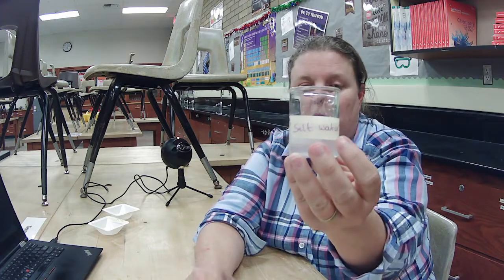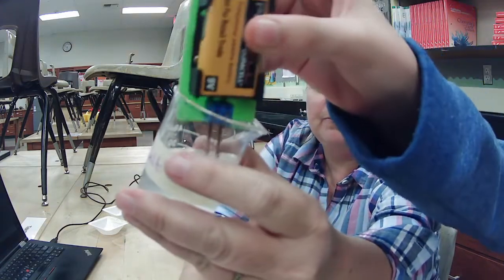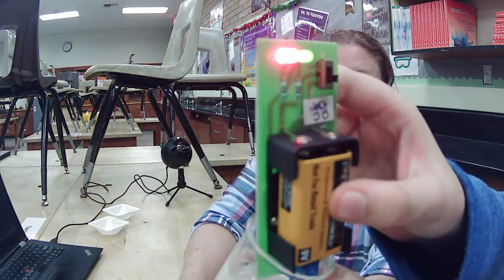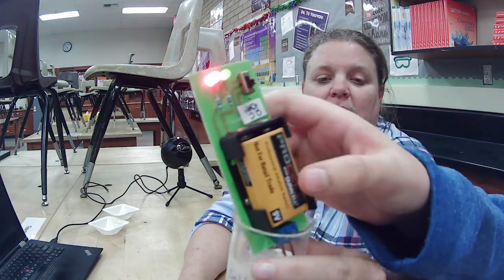We're going to test our last one, salt water. Salt water has the ionic bond dissolved in it. Remember, when ionic bonds go into water, they actually separate. So the sodium and chlorine separate out. Let's see what happens to our conductivity then. It's super bright. It's very, very high. So go ahead, take it out, turn it off. Go rinse it one last time. Salt water has an ionic bond.